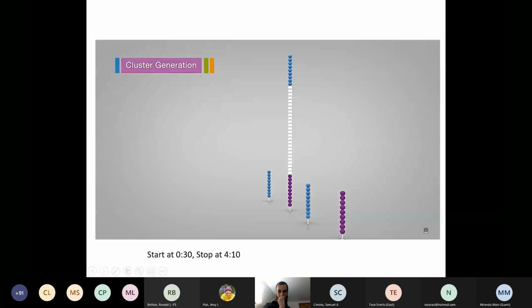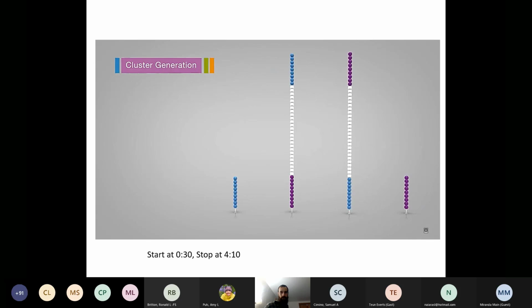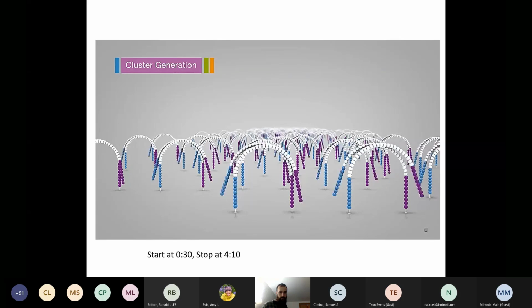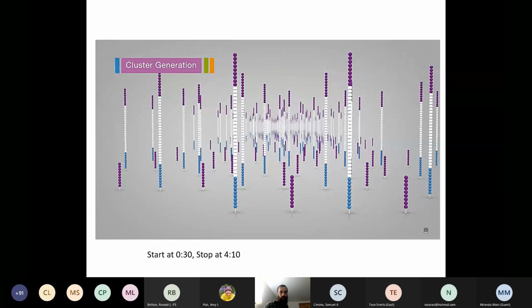The strand folds over, and the adapter region hybridizes to the second type of oligo on the flow cell. Polymerases generate the complementary strand, forming a double-stranded bridge. This bridge is denatured, resulting in two single-stranded copies of the molecule that are tethered to the flow cell. The process is then repeated over and over and occurs simultaneously for millions of clusters, resulting in clonal amplification of all the fragments. After bridge amplification, the reverse strands are cleaved and washed off, leaving only the forward strands.